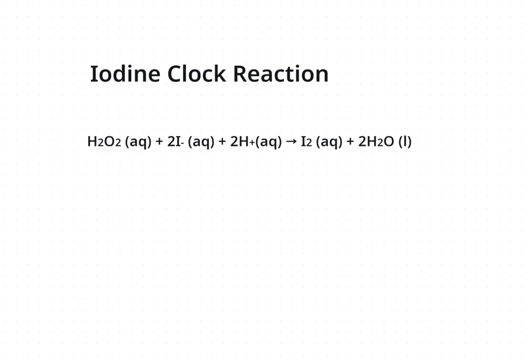So it's a gradual change in color, and it's also not a very sharp color, so it's quite difficult to record it.